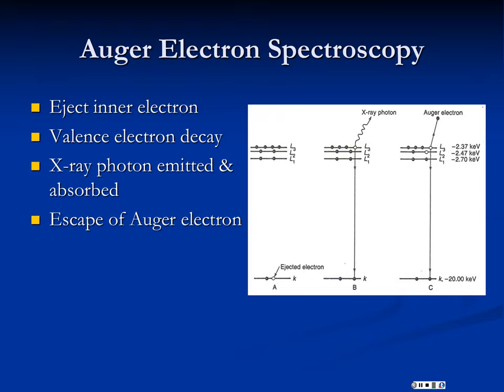They're never going to get out. Also, because they have such low energy, they're very difficult to measure. You have to have ultra vacuum, a better vacuum than space, and you have to have very sensitive detectors to find them. So Auger spectroscopies are relatively expensive, but if you want to know surface chemistry, it's the way to go. It'll give you just the surface behavior.